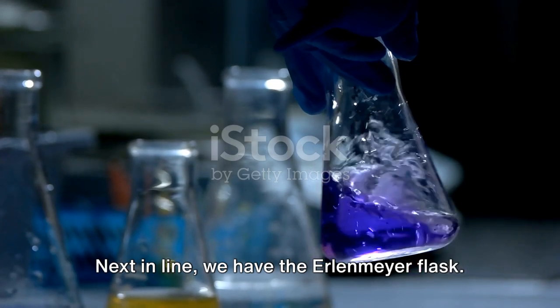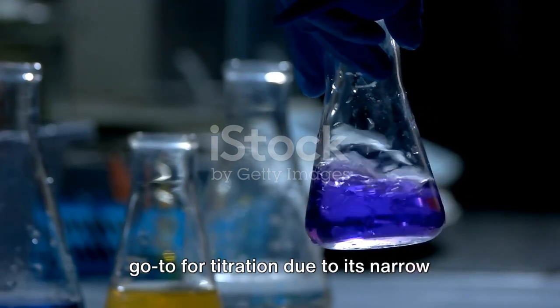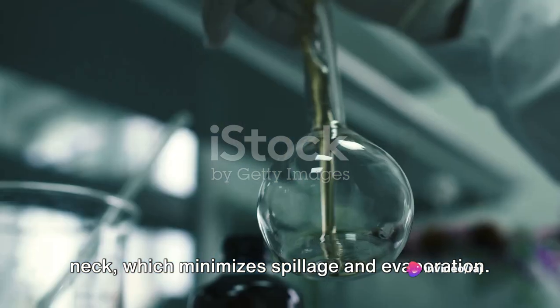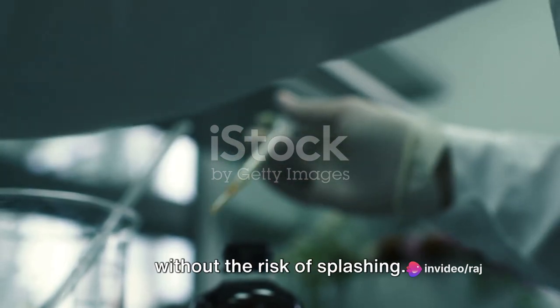Next in line we have the Erlenmeyer flask. This conical piece of glassware is a go-to for titration due to its narrow neck, which minimizes spillage and evaporation. It's also fantastic for swirling mixtures without the risk of splashing.